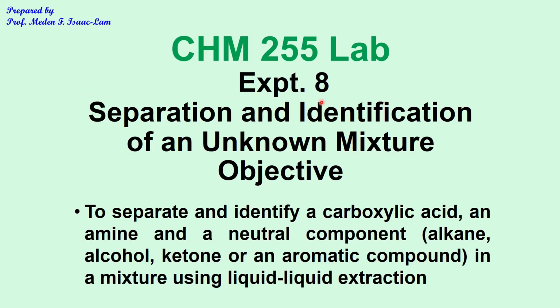Experiment 8 is about separation and identification of an unknown mixture.